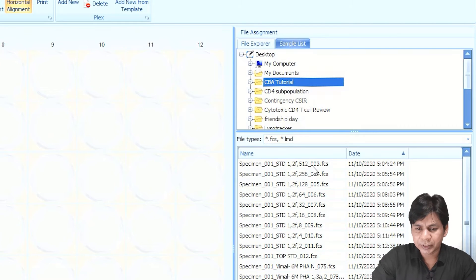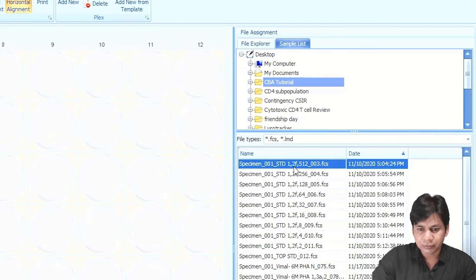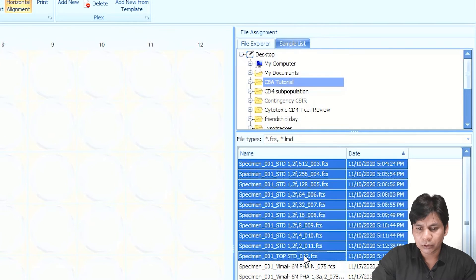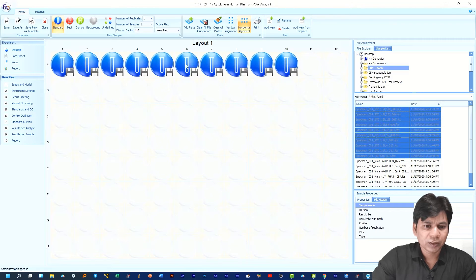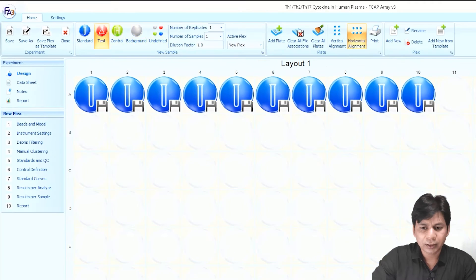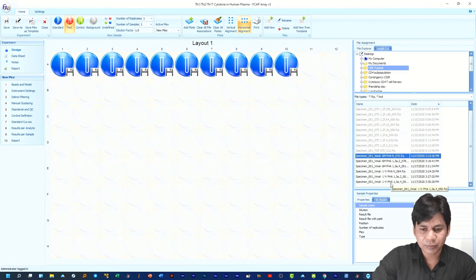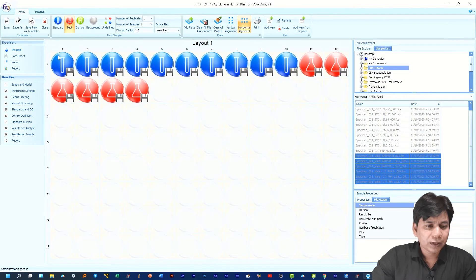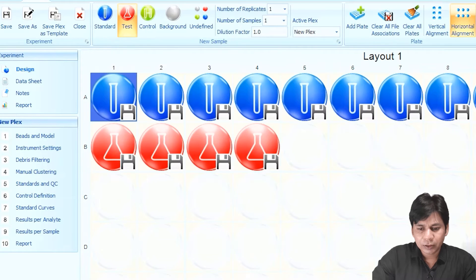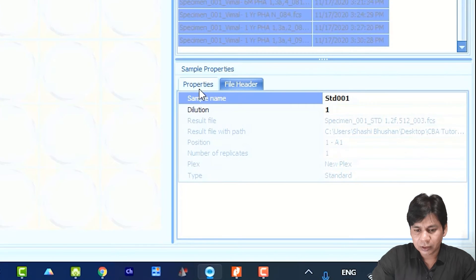First I have to select the standard. I am selecting standards from Standard 1 to the top standard, and selecting and dragging them into the layout. For the samples, you have to select 'Test' and then select your test sample and drag it into the layout as well. If you click on any well in the layout, you can see the information in the Sample Properties panel.